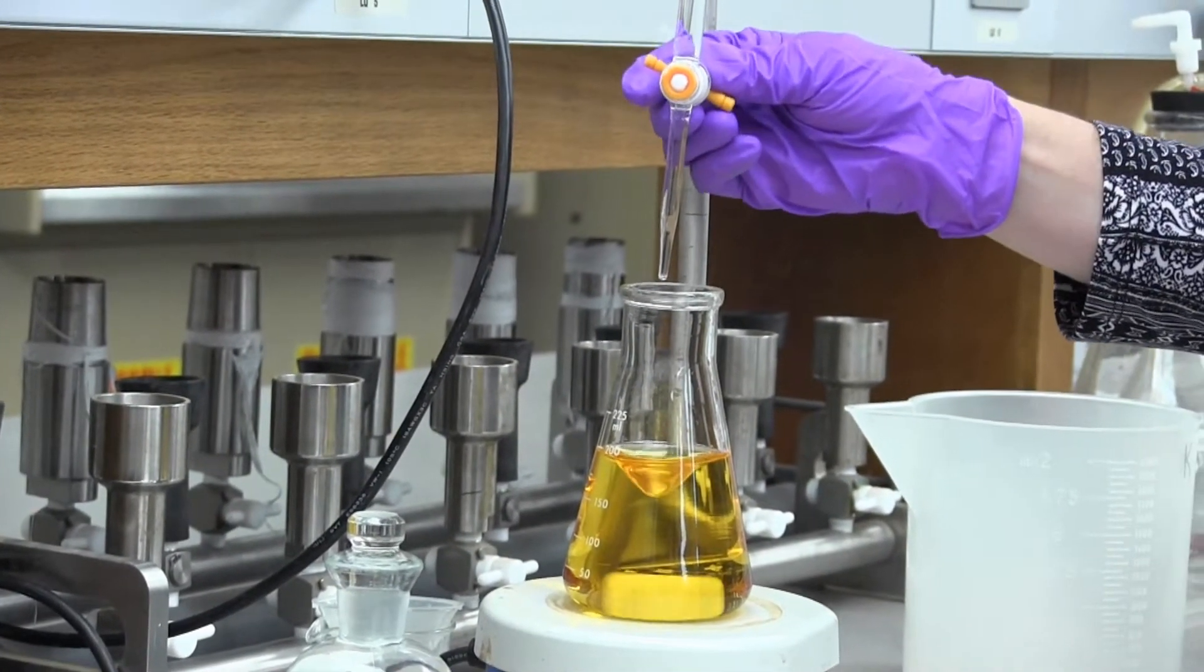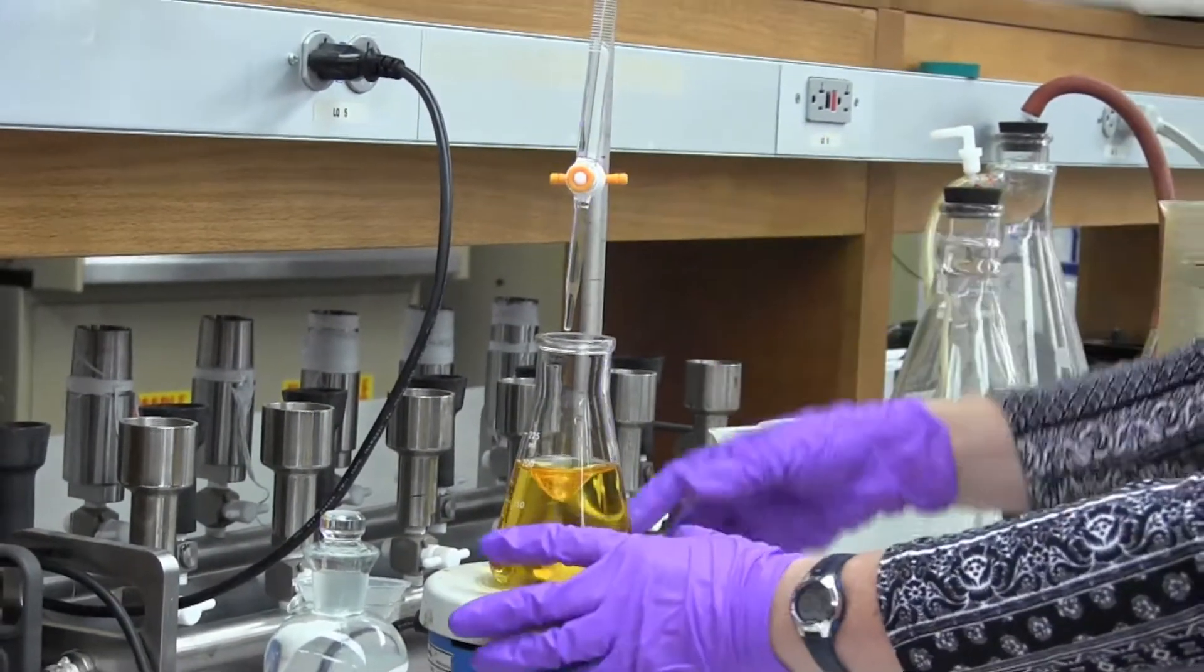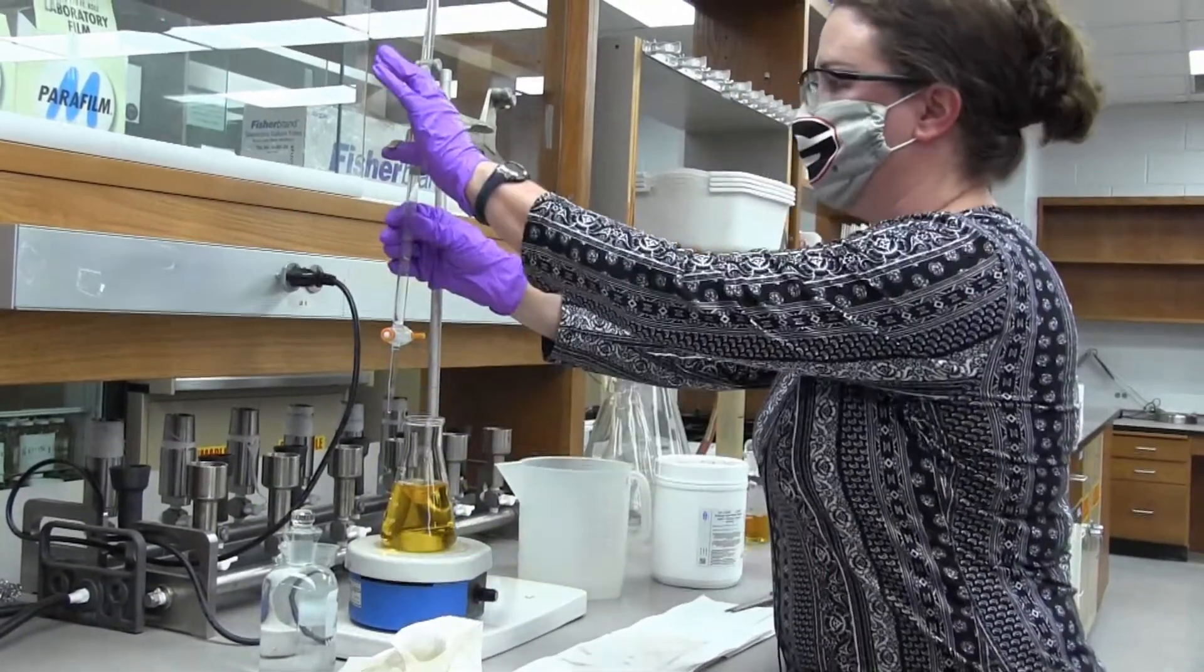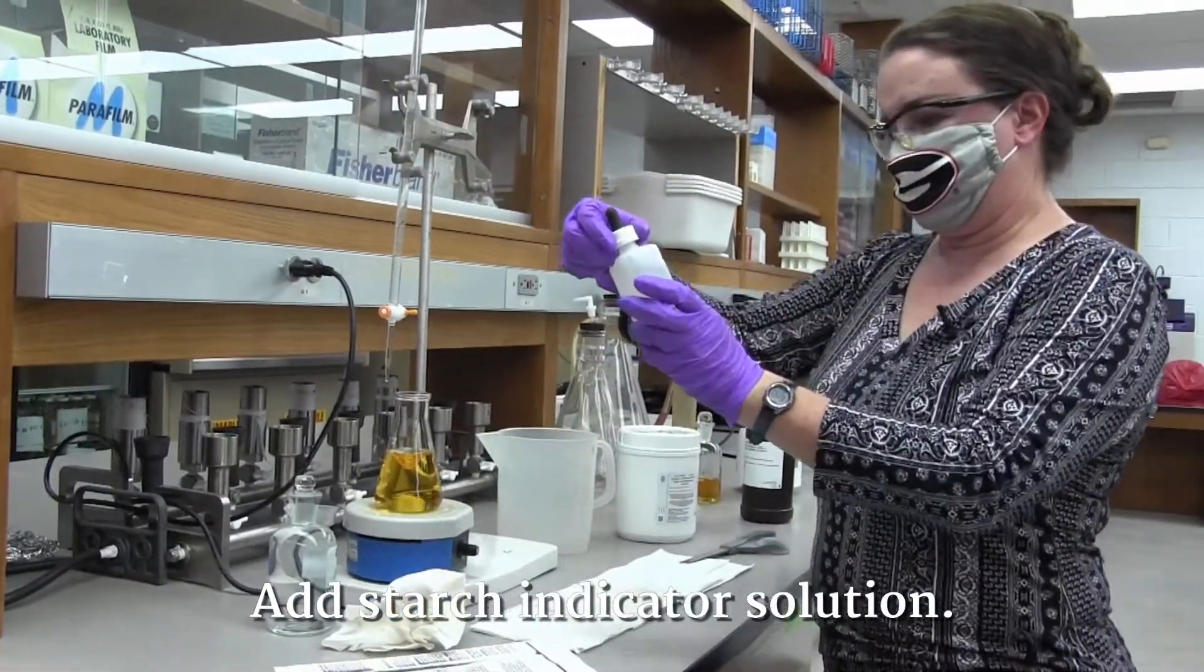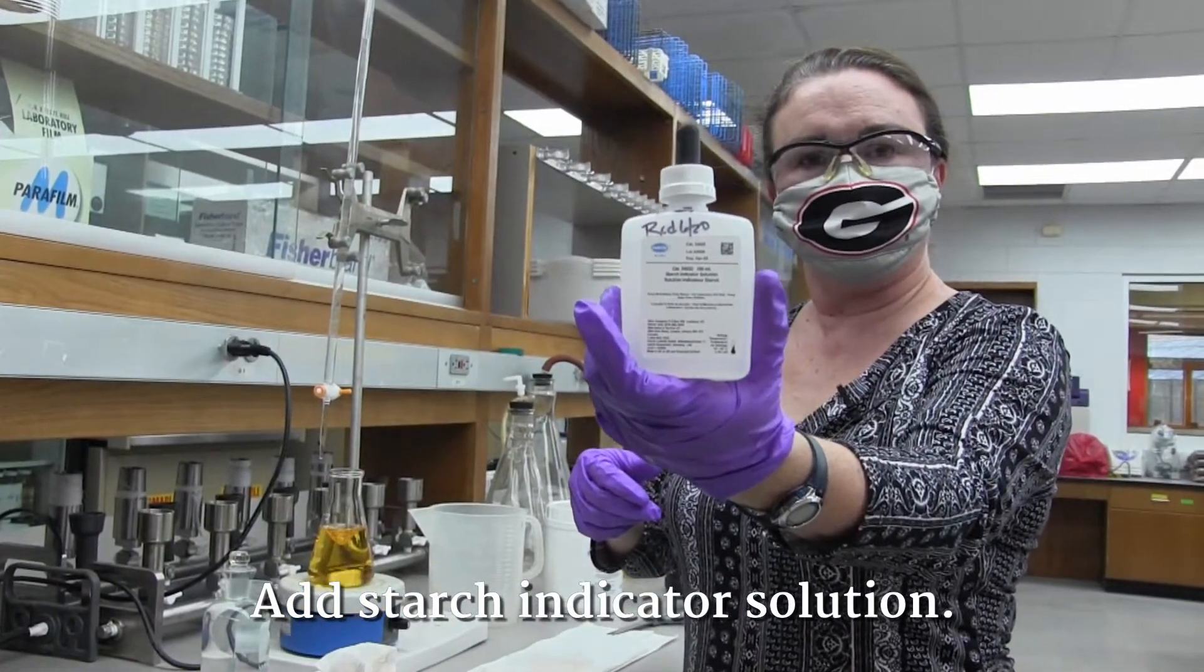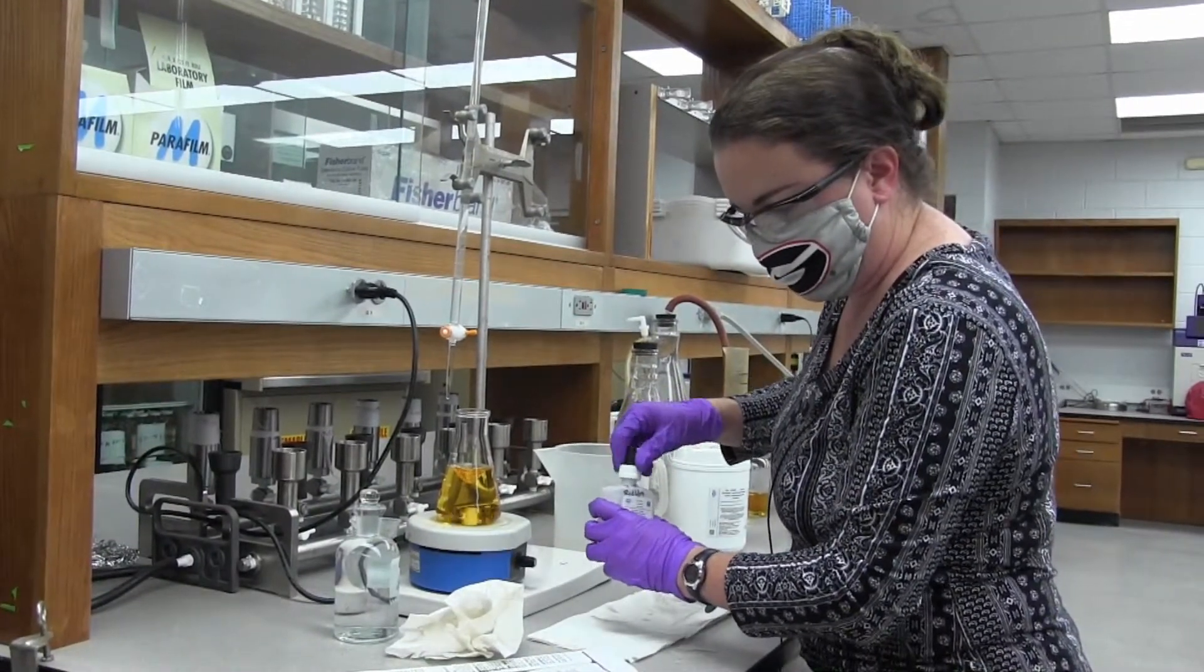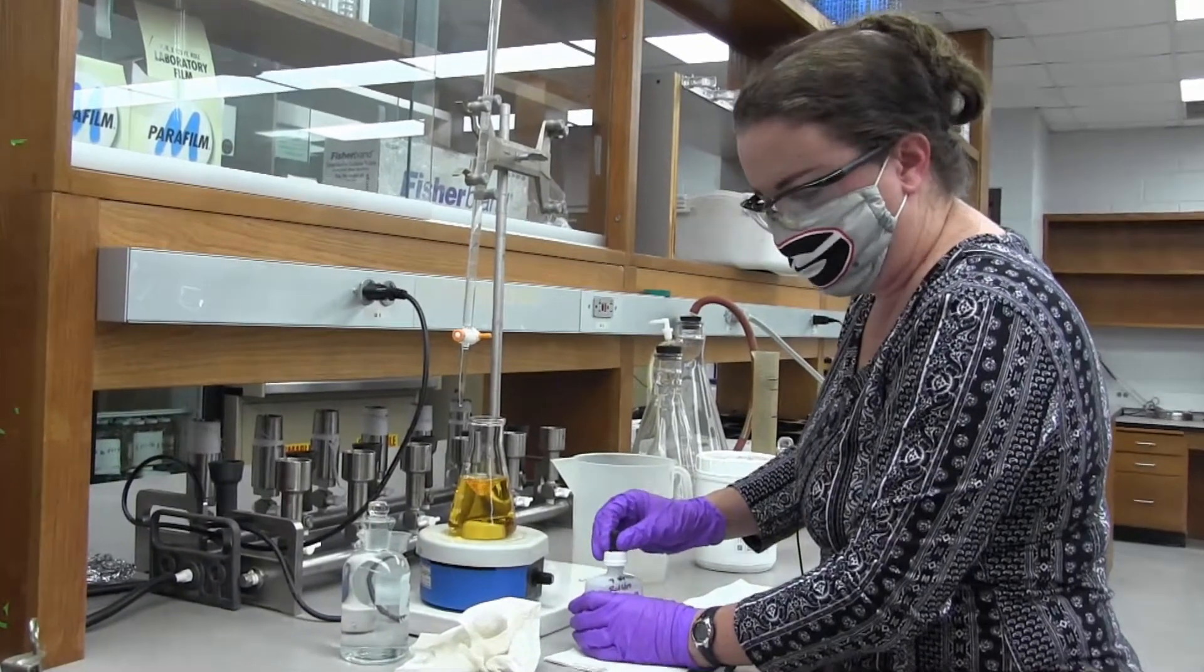Now we're going to add two dropper fulls of starch indicator solution and we're going to keep swirling it to mix. Here's our starch indicator solution. We're going to put two dropper fulls of this in there. We're going to see a dark blue color now.